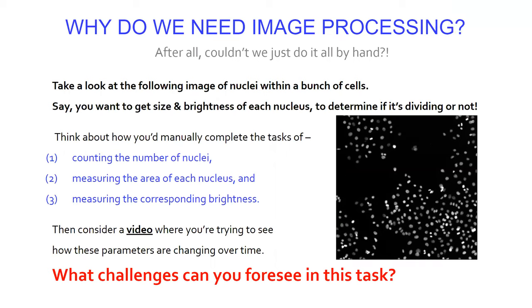I could imagine you'd want to do it that way in case you wanted to see exactly what was happening. That way you can actually see and observe cells dividing and track them by hand rather than trusting a machine. Yeah, that's a good point. Sometimes you want to do it because it's something you can see, as opposed to something a machine has done, you just trust it more. You believe what you see. That's a good reason. Anyone else have any thoughts?